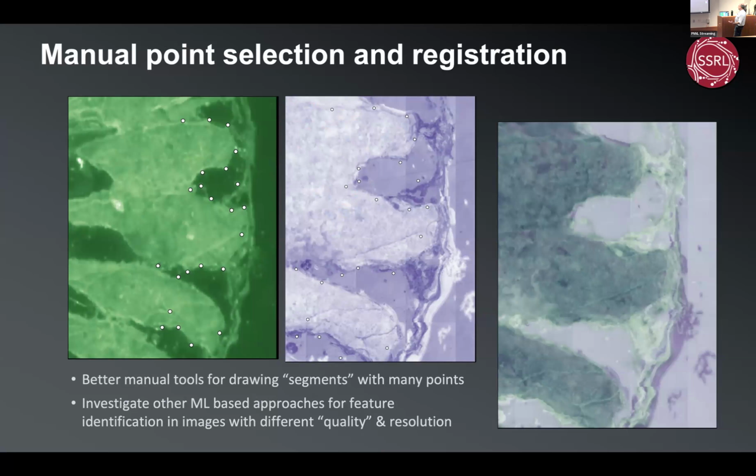And so I did fall back and say, okay, I can draw a bunch of dots on one image. I can draw a bunch of dots on a second image. Don't have as many dots as the machine vision tries to analyze with, but as long as I put at least about 10 or 12 dots in there, I can do a pretty good job. And it did it pretty well. Got a good overlay and a good matching.